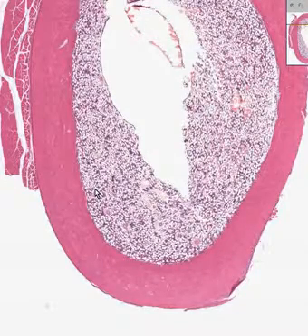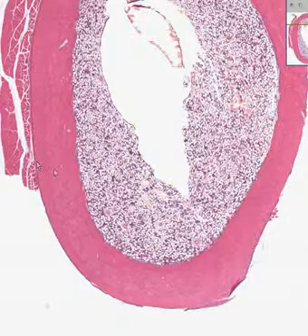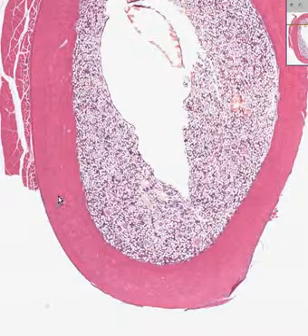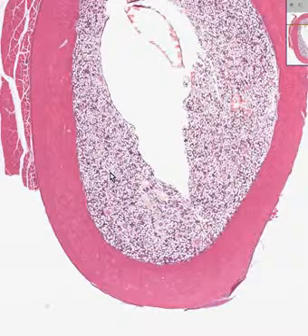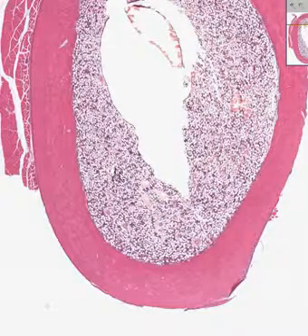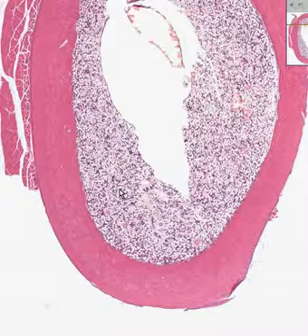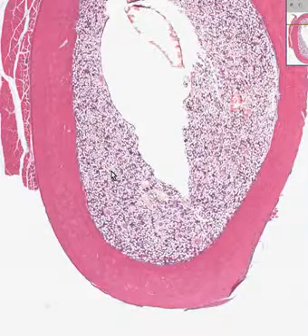Here we are back to our section of rib. In this rib, you can see very dense pinkish material here, which you will see as classical for cortical or dense bone, while the inside of the rib contains fat and cells, the fat being normally found in our marrow and the cells being hematopoietic cells, giving rise to red cells, white cells, and platelets, found in the bone marrow of the bones of the central or axial rather than the appendicular skeleton.